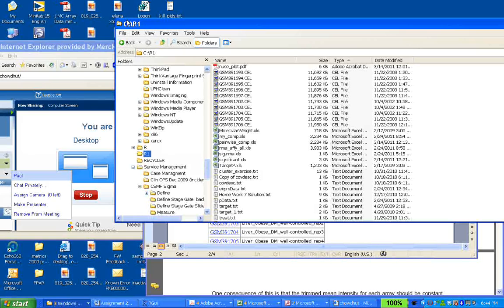So you need to unzip those files. You probably had more cell files than I asked for in the homework, but you can unzip them, and the ones that you need you can move to your working directory, from which R will be pointing and from which I'll be working.